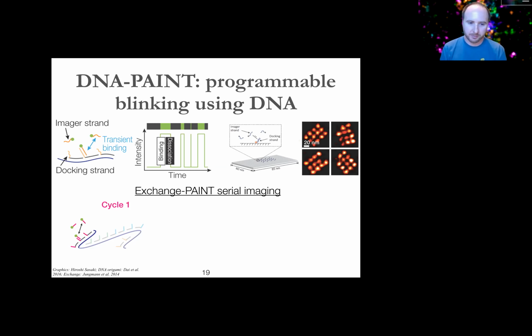And then because the binding is so transient, we can essentially just do a simple buffer exchange and then add the sequence that's complementary to the next target, which in this case is green. And the key thing here is that the fluorochrome is actually the same. So we're using the same imaging channel. We're just doing it in serial rounds. And for super resolution, that has a lot of advantages in terms of avoiding the need to account for things like chromatic aberration that can be quite tricky over these length scales.